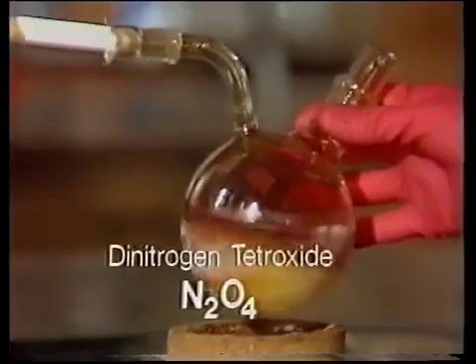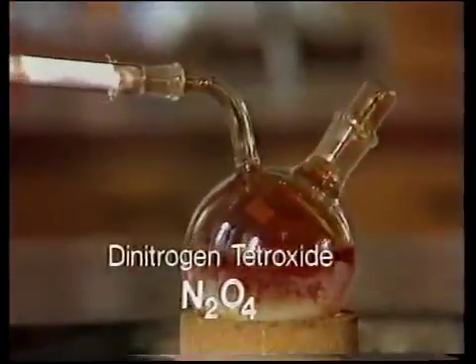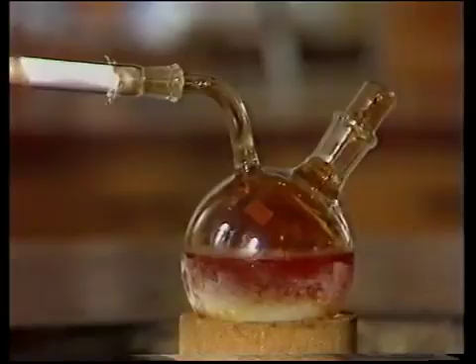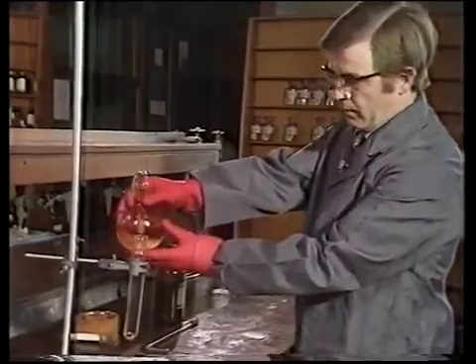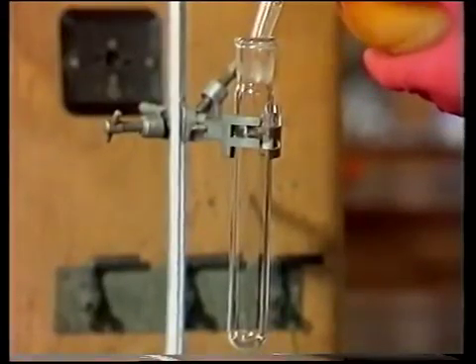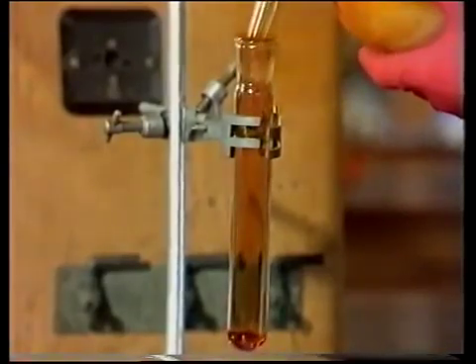This is a sample of dinitrogen tetroxide, a compound which reacts very vigorously with many organic compounds. And today we're going to react it with aniline. We must pour the N2O4 rather carefully because it boils at a low temperature, and we don't wish too much of it to vaporize as it is rather toxic.